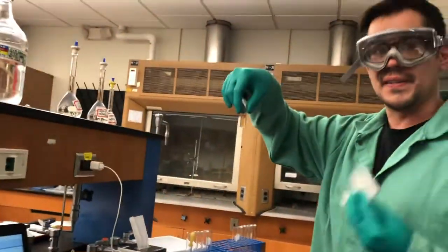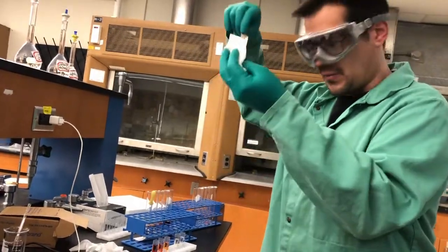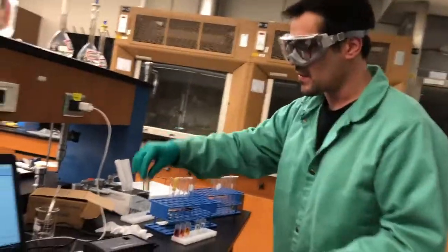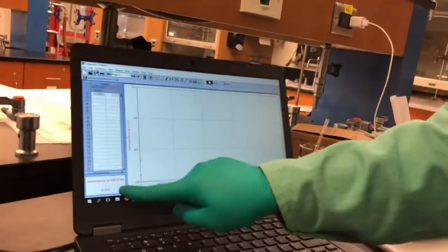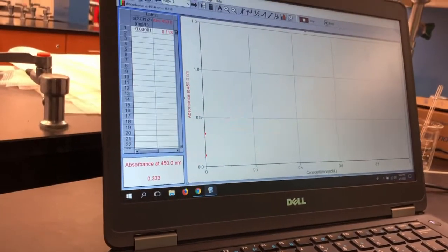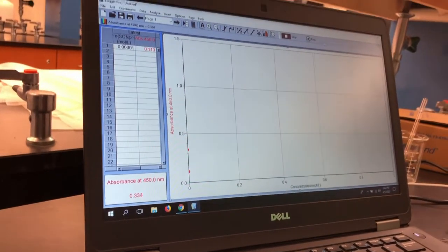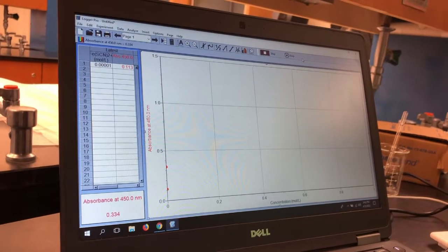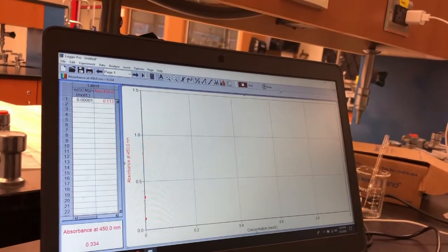Now I'm going to go on to my next one. This is number 2. Again, the color is getting more intense, darker. The concentration of your iron nitrate is increasing, right? We put 2 mils in this one now. And as you'd expect, absorbance is increasing. So we were at 0.113. Now that there's more in there, more to absorb, we're seeing a higher absorbance. So this is at 0.334. We're going to let this calibrate, kind of equal out, steady off, and then we're going to push keep.